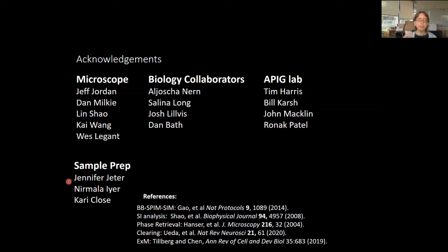But the Airy scan has a little multi-element detector so that they can use the Airy pattern of the illumination as structured illumination. The structure isn't very deep and doesn't have very high contrast, but it does allow a form of structured illumination, and it pretty much works.